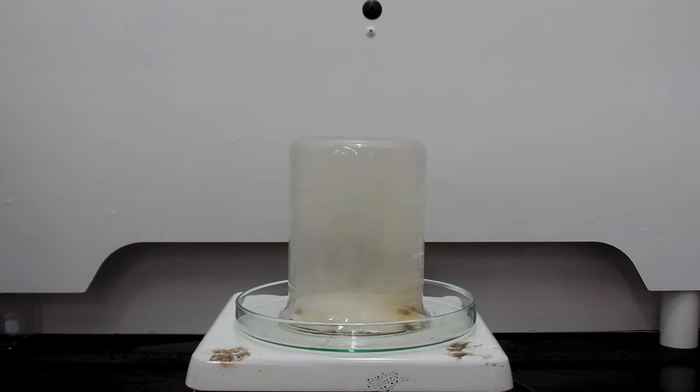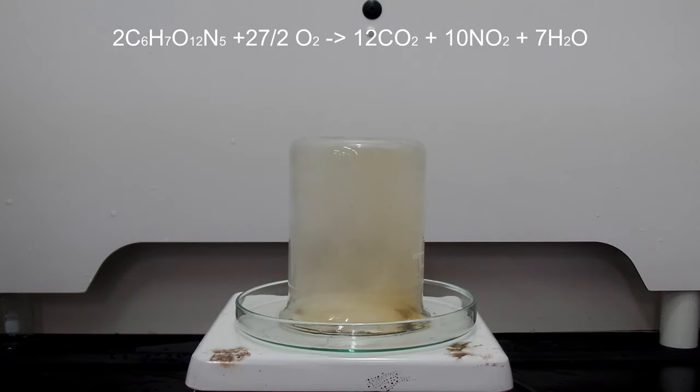So the appropriate reaction formula should be like this. This in fact is the combustion of nitroglucose. For cellulose being a polymer of glucose, I think it's accurate enough.